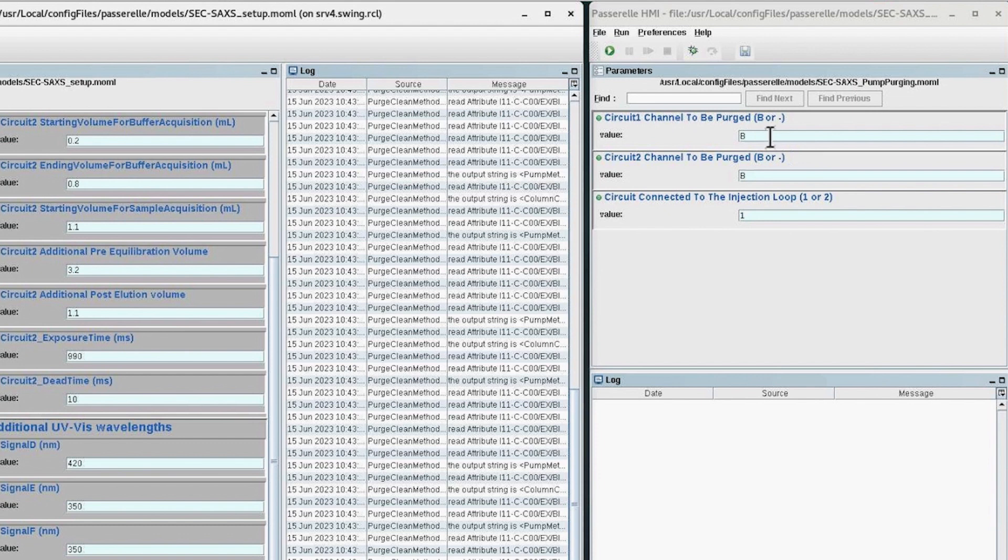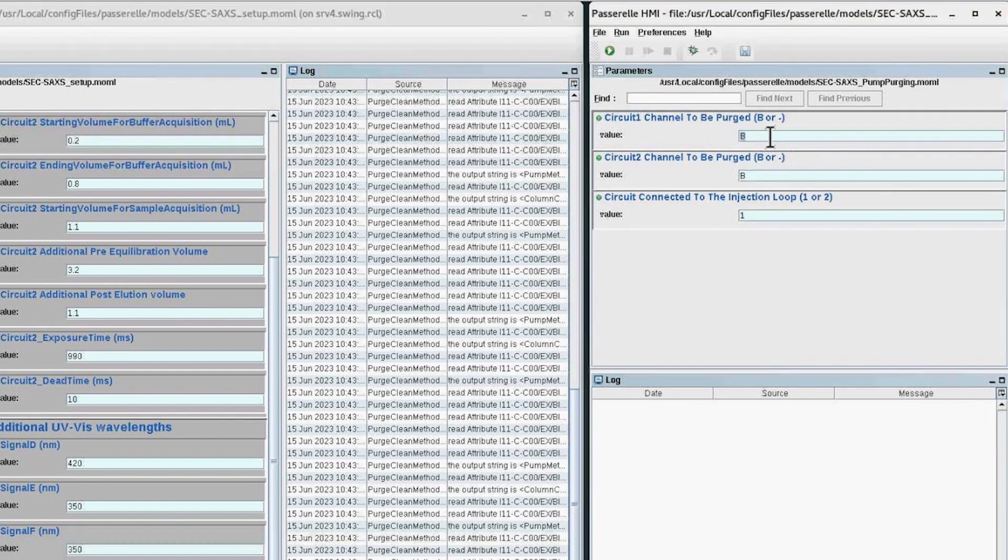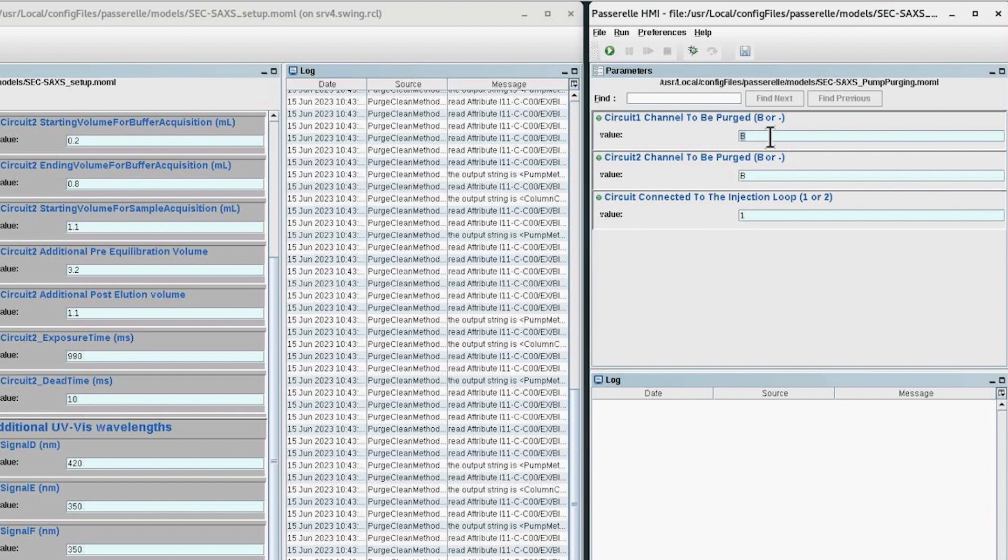Otherwise fill with a dash. In this example, the two circuits will be purged simultaneously, hence B1 was entered for the two circuits.